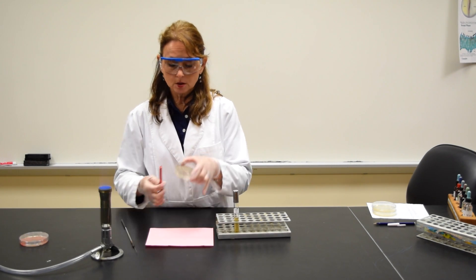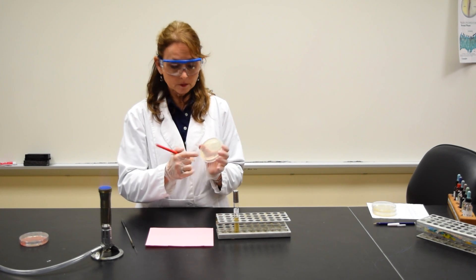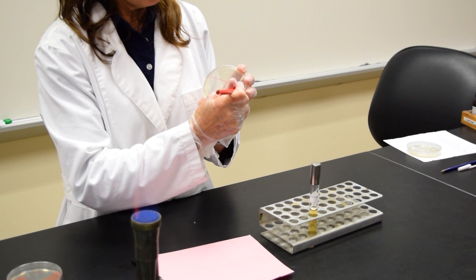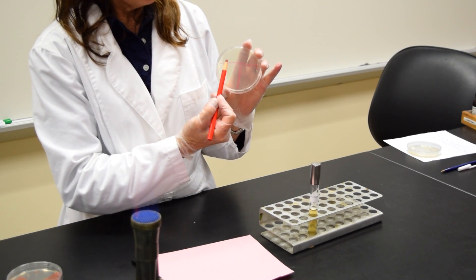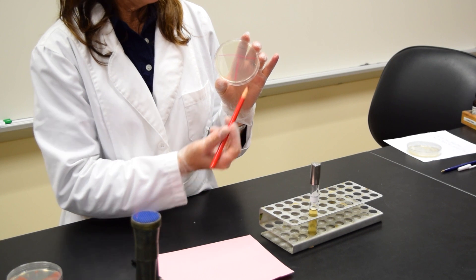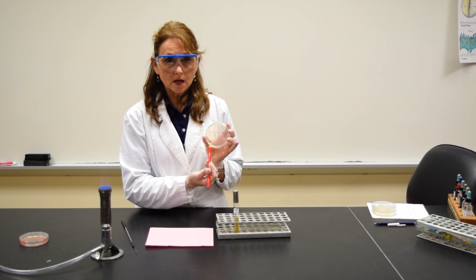It's called the T-streak because you take your petri plate that contains the culture media and on the bottom of the plate, using my wax marking pencil, I'm going to make the letter T. The area above the T is area one, the bottom right is area two, and bottom left is area three.